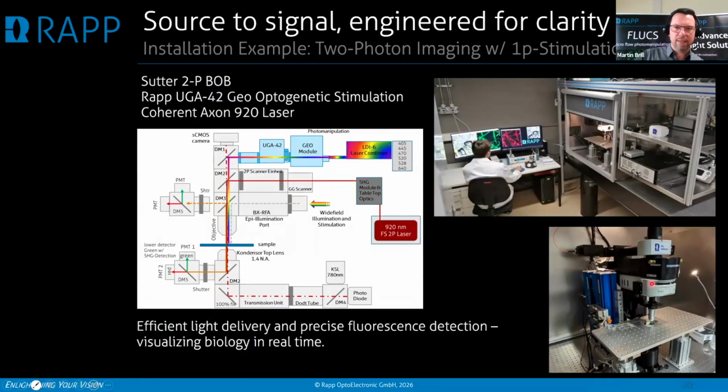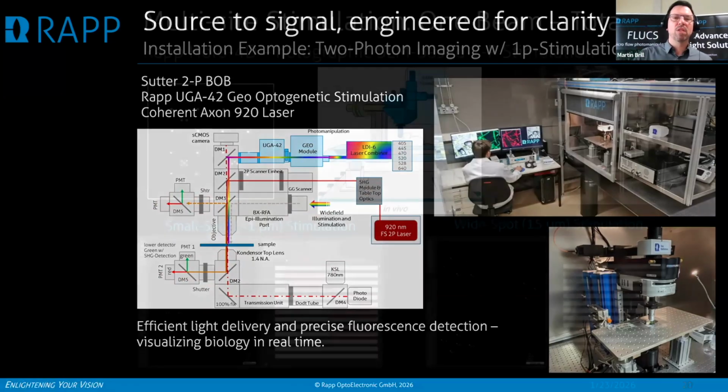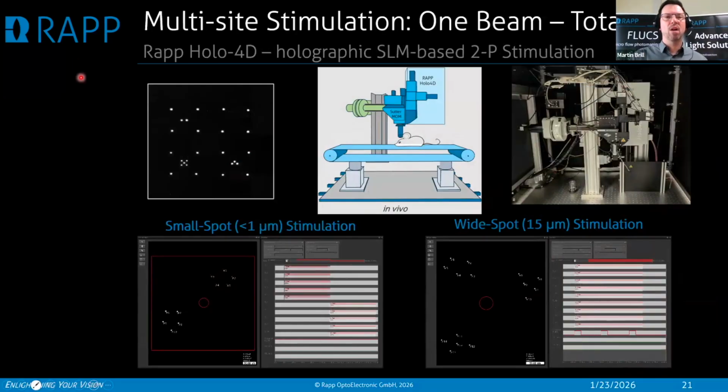And here, this is an in vitro microscope for slices or organoids, so that a 1-photon photostimulation is okay. We can scan it here with up to 6 different laser wavelengths. It goes through the same objective, and this system is then meant for recording and acquisition of the reflected 2-photon elicited fluorescence and for the transmitted 2-photon elicited fluorescence.